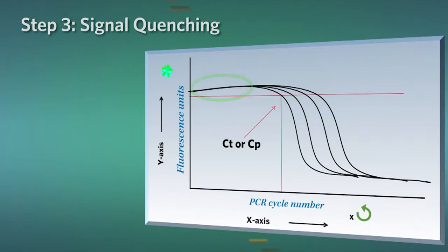The flat part of the curve represents the high initial fluorescence resulting from unincorporated primers at the start of PCR. As the reaction proceeds, the decrease in fluorescence due to the site-specific incorporation of the ISO-G associated quencher is shown as the downward curve on the graph.